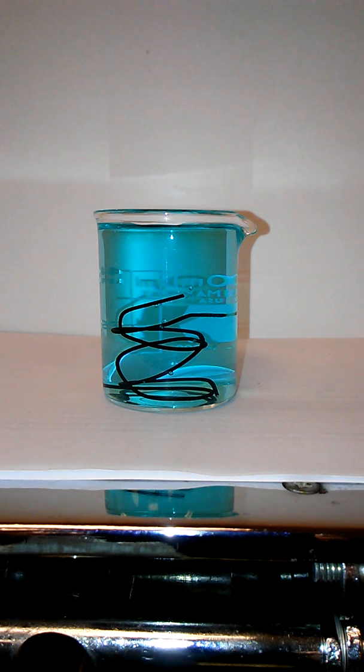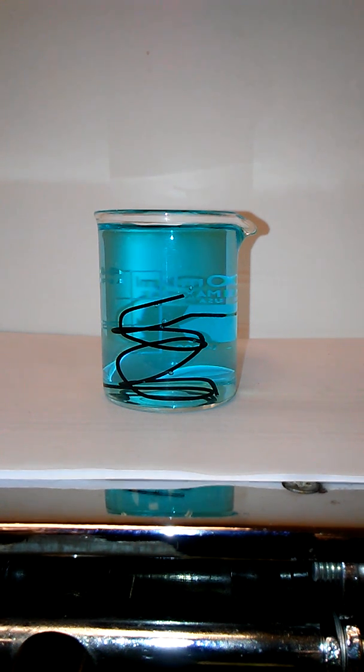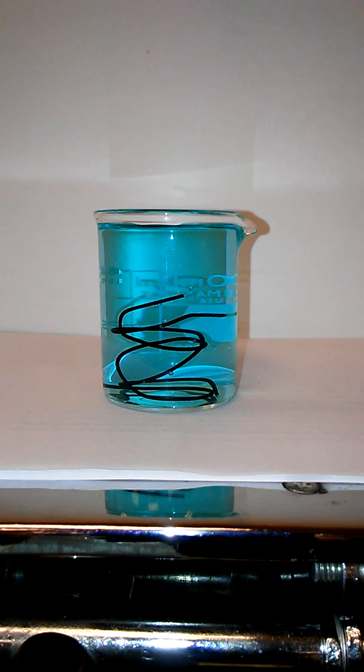That is going to give us, it turns out, because it's a single replacement reaction, one thing is replacing another thing. Iron, of course, is a metal. So what's the metal part of the copper 2 nitrate? The copper. So the iron is going to replace the copper, and the copper is going to come out of solution. And so what we'll end up with, as this reaction continues, is solid copper metal and iron nitrate solution. It should be iron 2 as well.